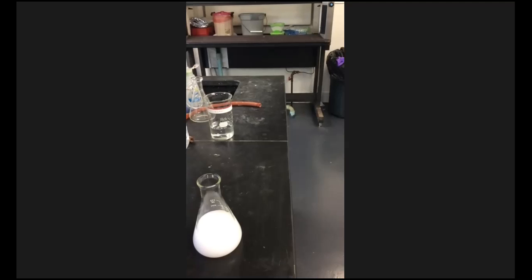So we're gonna let that sit, we got a little bit less than a minute left, and I need to grab a watch glass. So hit me with another minute. I'm gonna run to the stock room and get a watch glass. Actually, no, never mind. We got one right here. Perfect. And I have a thermometer, because it's telling me not to heat it past 75, right?